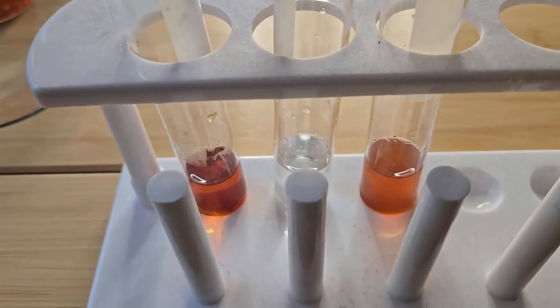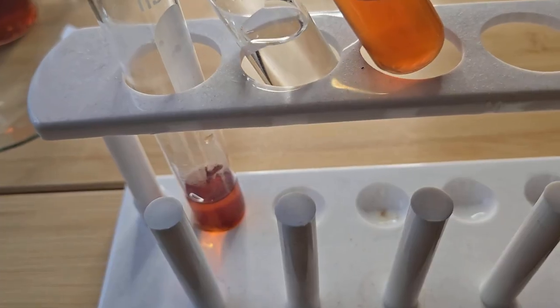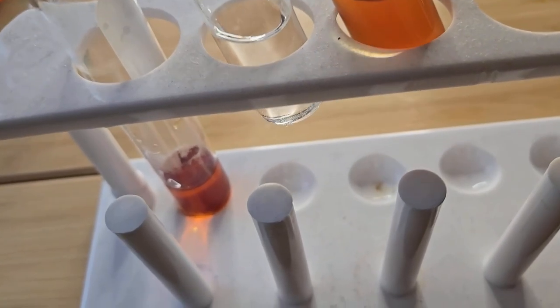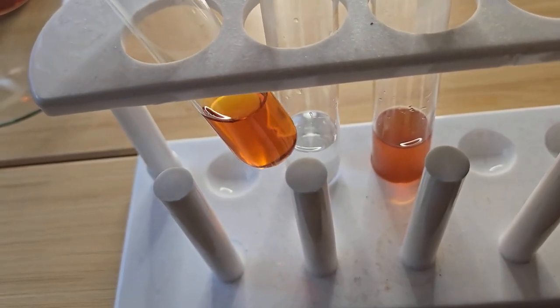Let's take another look at the sol that we added aluminum sulfate to. As you can see, it's starting to go cloudy. It's no longer a clear solution like this.